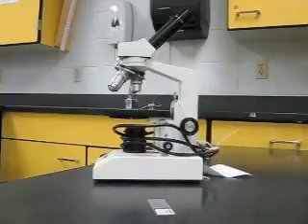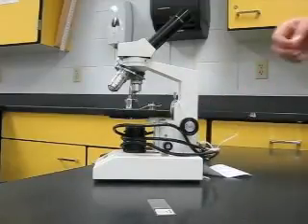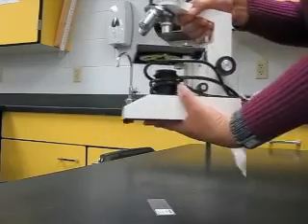When picking up the microscope, it's important to use two hands, one hand firmly on the arm of the microscope and your second on the base.